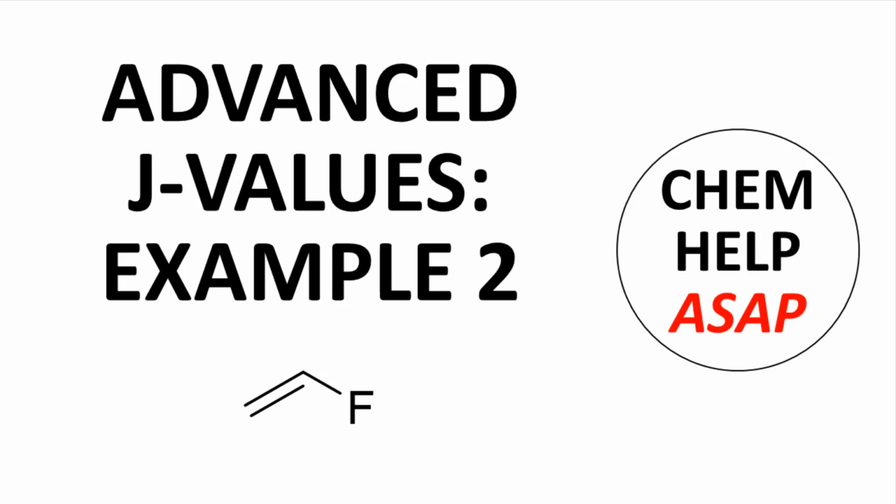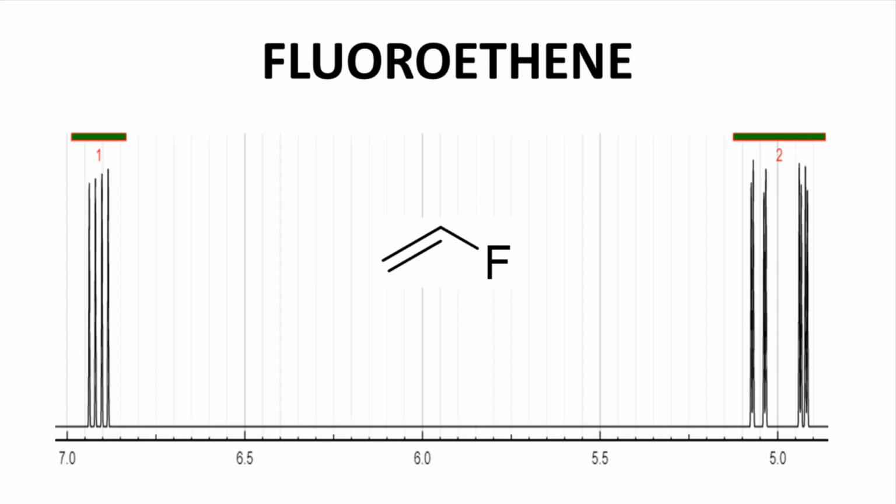Let's see an example of J coupling in proton NMR with hydrogens being affected by different J values, including an example of geminal coupling. Here is a very simple molecule with a not so simple spectrum. Have no fear, we can quickly make sense of the signals in this proton NMR spectrum. Let's start with the downfield signal at close to 7 ppm and move to the upfield signals.